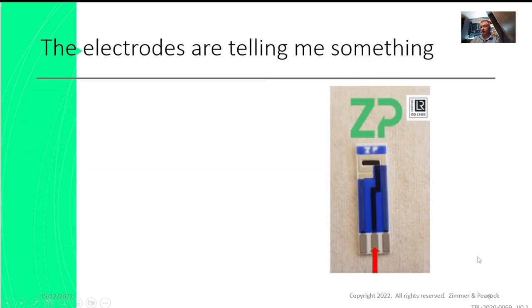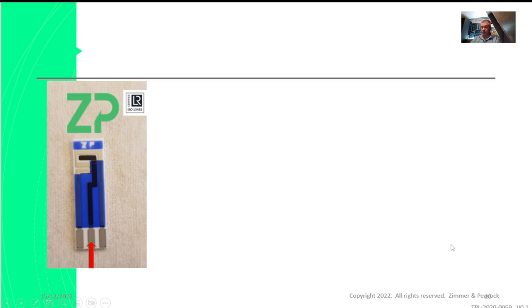So you should be attaching that, that's the working electrode, and attaching that, that's the reference electrode. But actually, the oxidation on that counter tells me it's not okay. Where do you think you're probably connecting your reference to the wrong pin? Not the world's biggest issue, but I just want to let you know that that's what's happening.